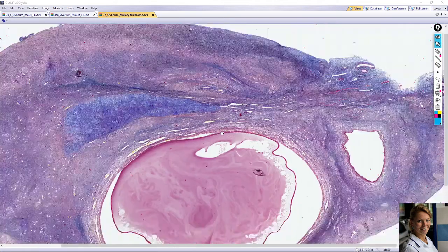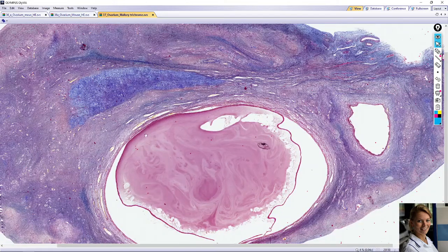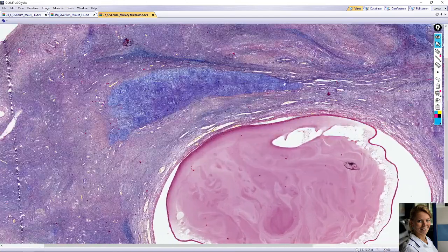So this is the mature follicle, Graafian follicle, and here you can see a blue staining structure. It's bad color, but this structure is called corpus albicans. This is the connective tissue scar, connective tissue with fibrocytes, fibroblasts, collagen fibers.